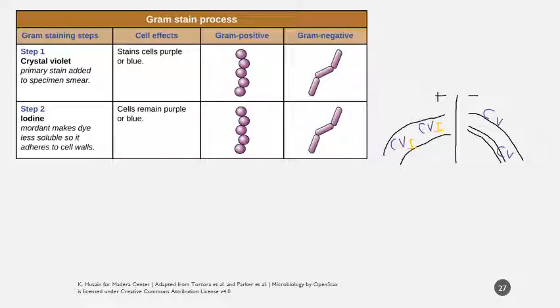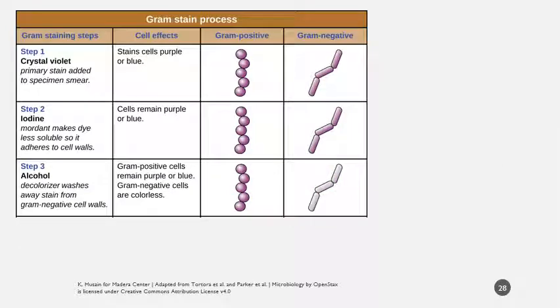With the gram-negative, you're going to have a situation where you have the iodine sticking to it, but the openings are still big enough that it's still going to come right out the first second it gets, or the first chance it gets. So again, I'm going to go on to the next step, and it's going to clear the diagram. So the next step is decolorizing.